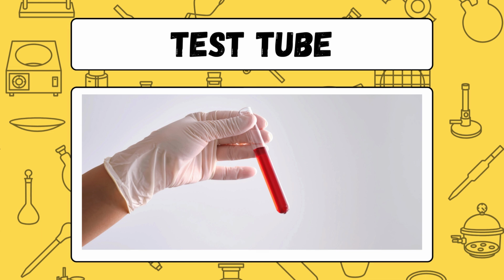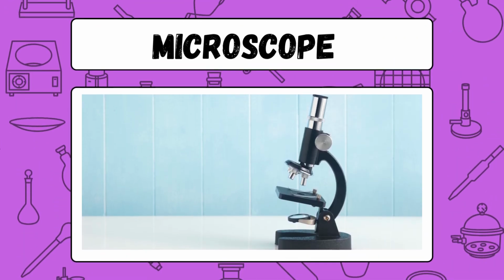Test tube. A test tube is a narrow cylindrical glass container for holding or heating small liquid samples. Microscope. A microscope is an optical instrument that magnifies small objects for detailed observation.